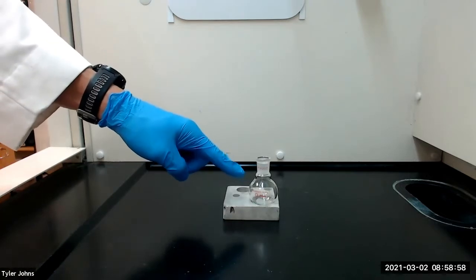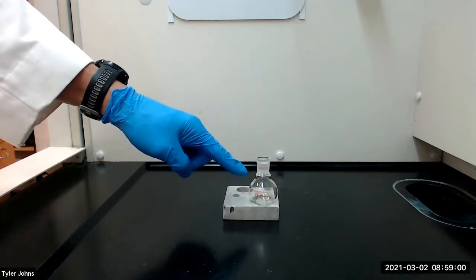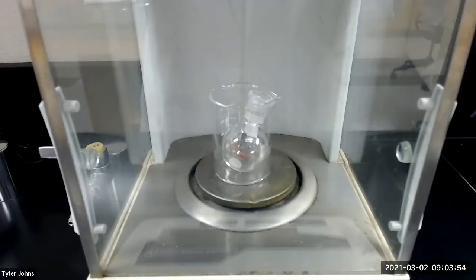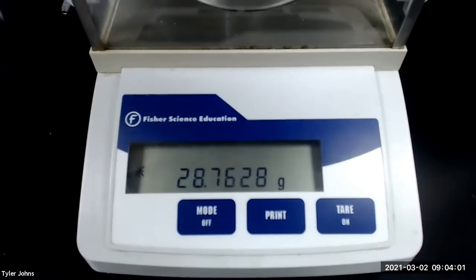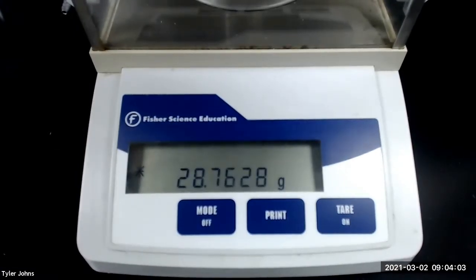To begin, we first need to pre-weigh a 25 milliliter round bottom flask. The mass of the pre-weighed 25 milliliter round bottom flask is 28.7628 grams.